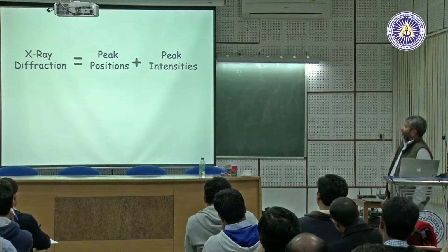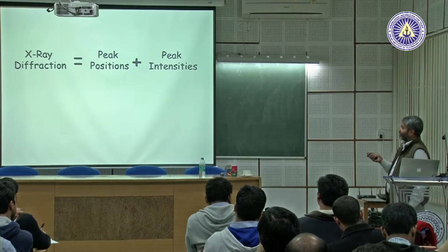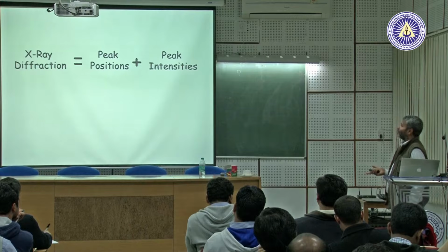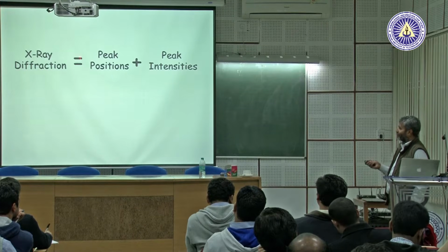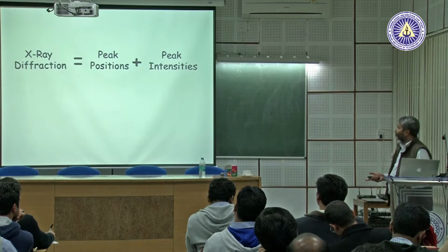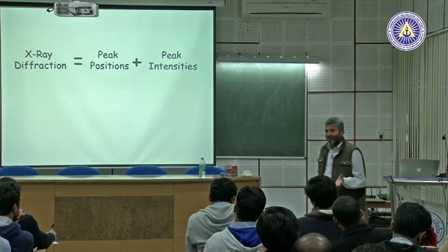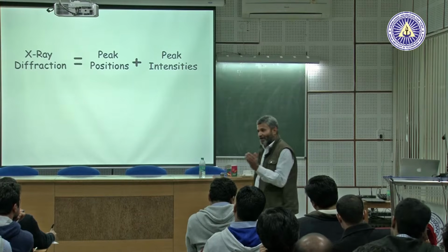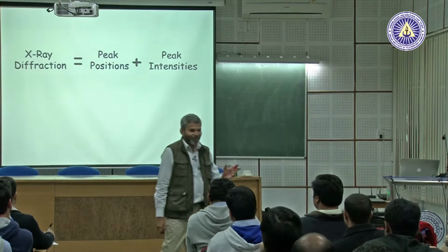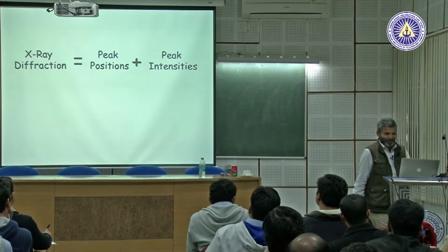Now, you saw the example of a diffraction pattern. There are peaks at certain locations and there are peak intensities. So essentially X-ray diffraction analysis is the analysis of peak positions and peak intensities. And interestingly, I told you in the morning class we had a lot of discussion on crystal and lattice, that crystal is equal to lattice plus motif. That equation and this equation are in exact correspondence.